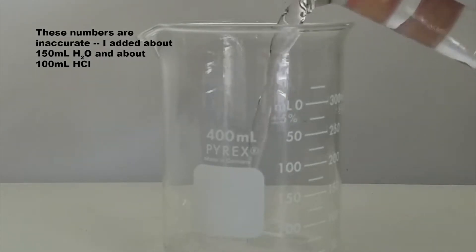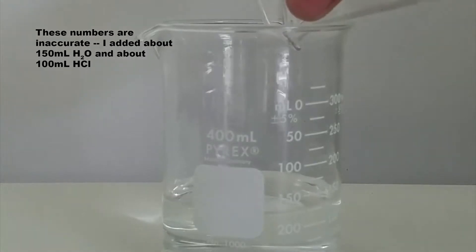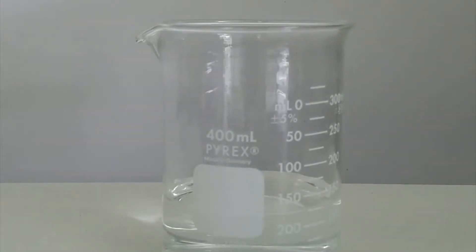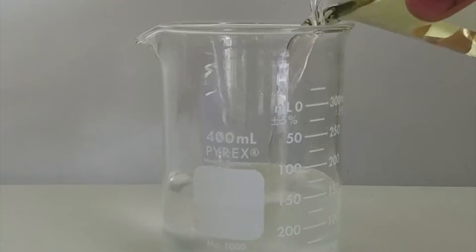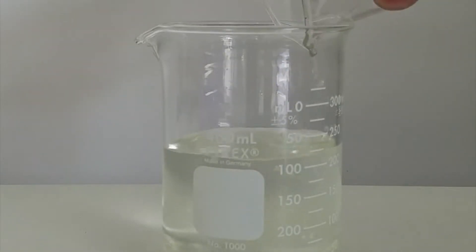To start, I added about 250 milliliters of distilled water and about 200 milliliters of hydrochloric acid to partially dilute it. Hydrochloric acid is usually clear, but in my case it was yellow, either because of impurities or some other dissolved solute.